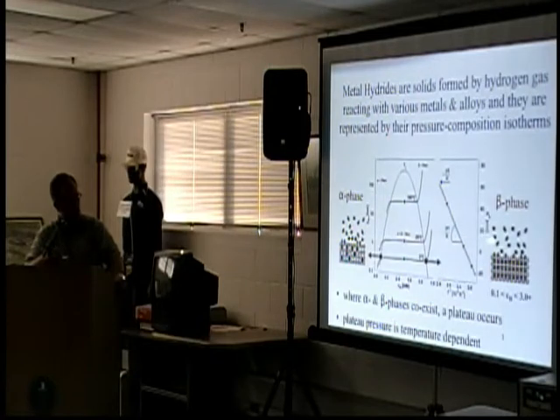On the other hand, if you keep exposing metals to more hydrogen gas at appropriate pressures, you can actually fill up the material, all these interstitial sites, up to as many as 3 hydrogen atoms per each metal atom. So it's very concentrated. There's often a phase transition, you get changes in crystal structure, and very different properties. You take lithium metal, this is a conducting metal, you react it with 1 hydrogen, form lithium hydride, it's an ionic salt. And there are a lot of examples, but many of them, things like uranium, remain a metal.